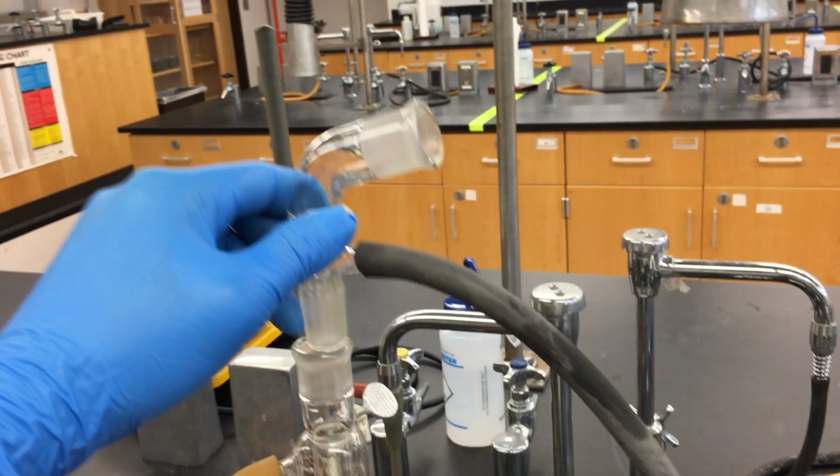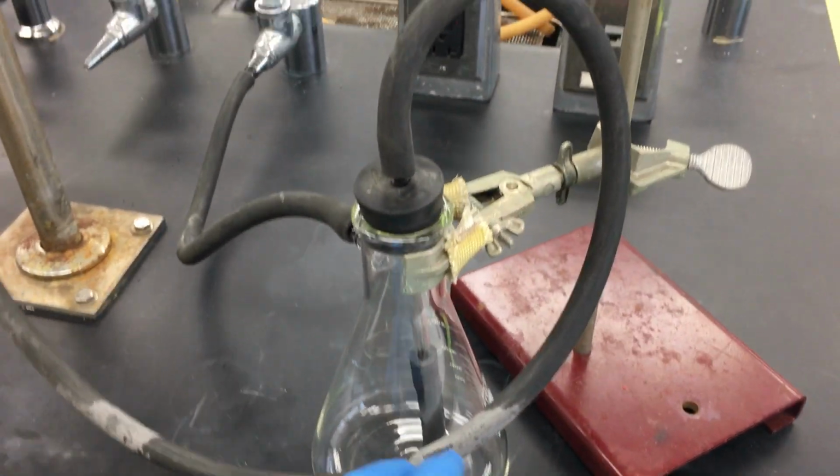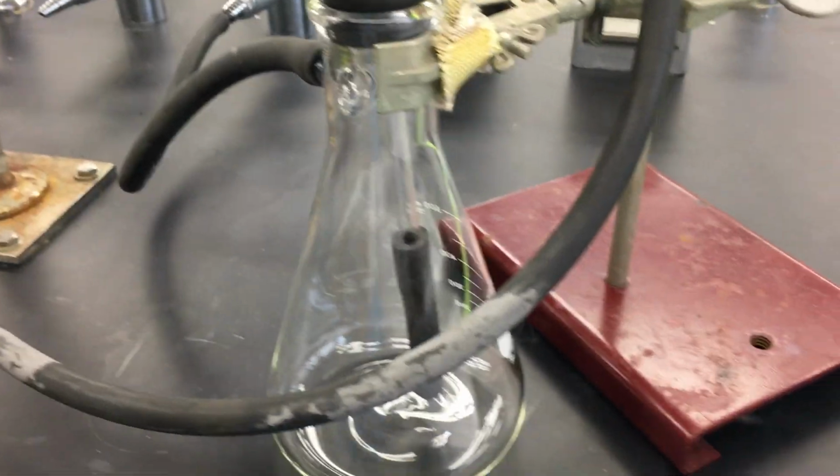But at the same time, by attaching this vacuum adapter, which is connected with a hose to this trap. Now in this trap, what we will have here is a solution of sodium hydroxide.